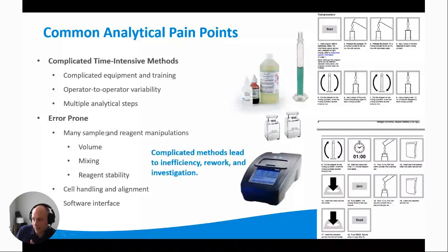So, in summary, on this slide, complicated methods lead to inefficiency, rework, and investigation, especially in a regulatory environment. And all of that is not helping you do more with less. That's really a drag, and those are things that we want to avoid.